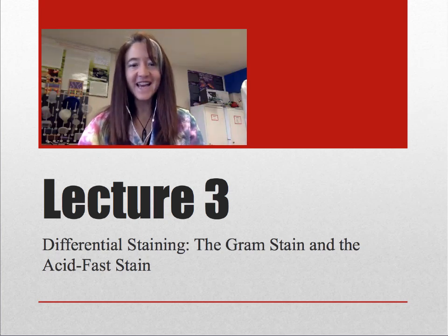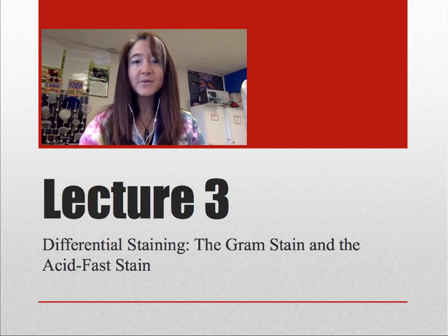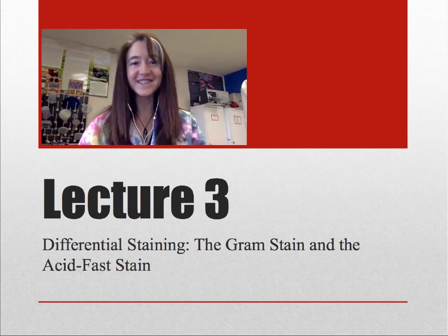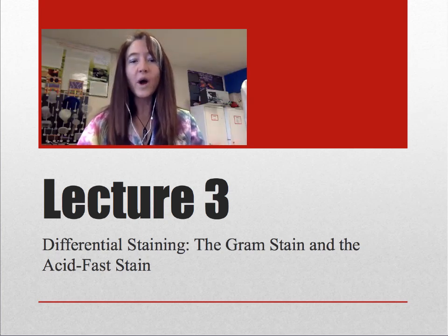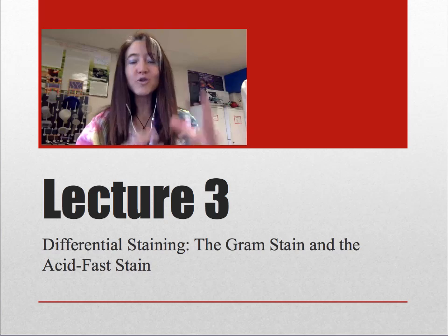That's why we're here today to talk about differential staining, where the color actually matters. That is, depending upon the nature of the cell, we're going to see that one type of cell stains one color, another type of cell stains another color. And that's why I've donned my tie-dye lab coat today for this lecture. I thought it might be cool to exemplify differentiation based upon color. So we'll talk about what it means in certain stains, such as the Gram stain, if something stains pink or if something stains purple, and look at that, what it indicates about cellular structure.